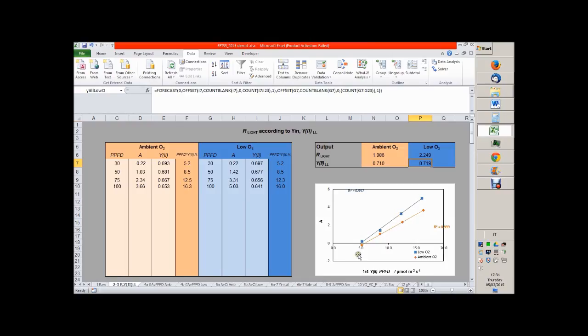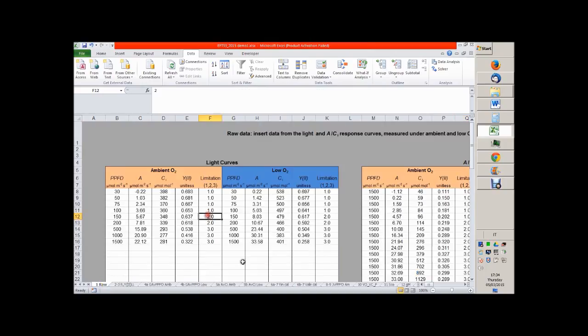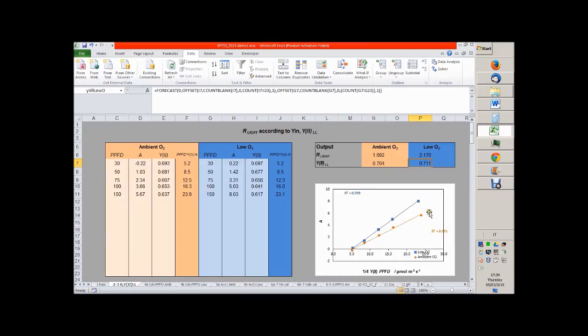I want to exemplify how changing the limitation will automatically change the plots in here. So for instance, if I go back on the raw data and assign one more data point to the limitation 1, this will be automatically plotted here and our regression will be 1 point longer. The regression to obtain the yield of photosystem 2 under 0 light intensity is not plotted here, but will appear in additional features, and I will describe this in a separate video.